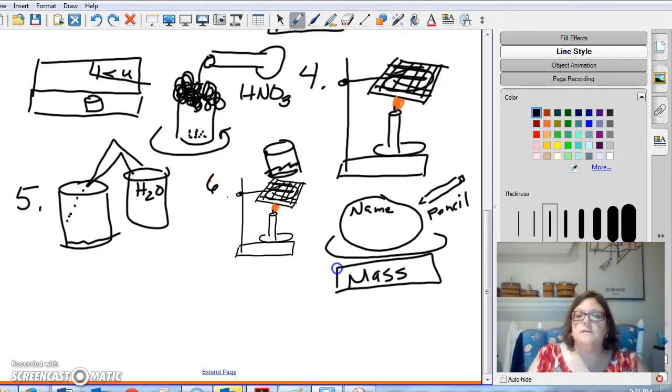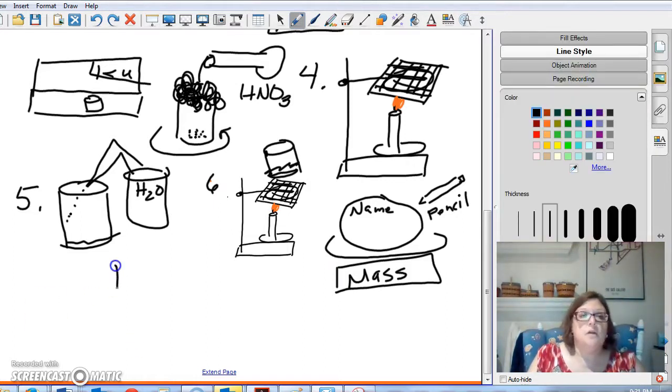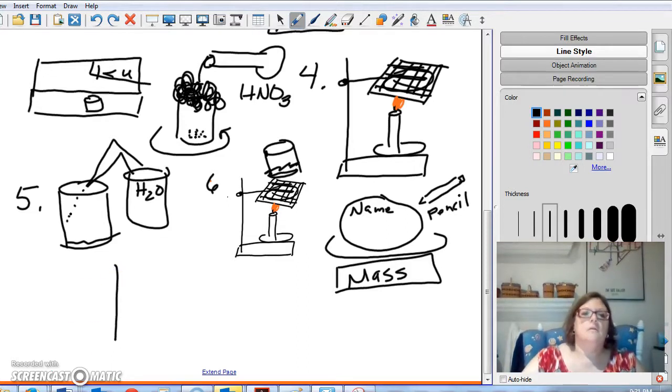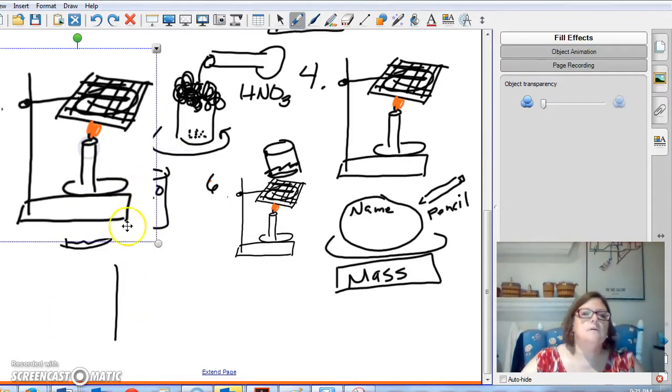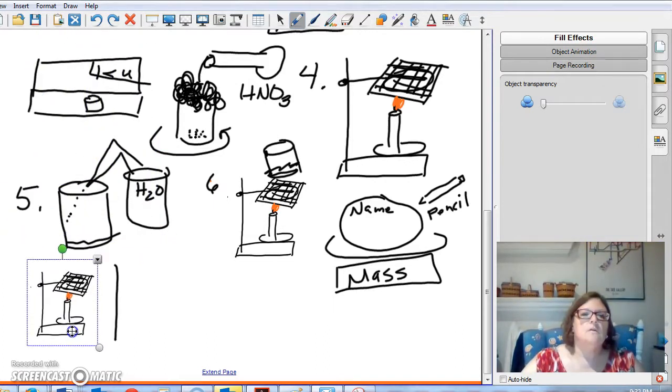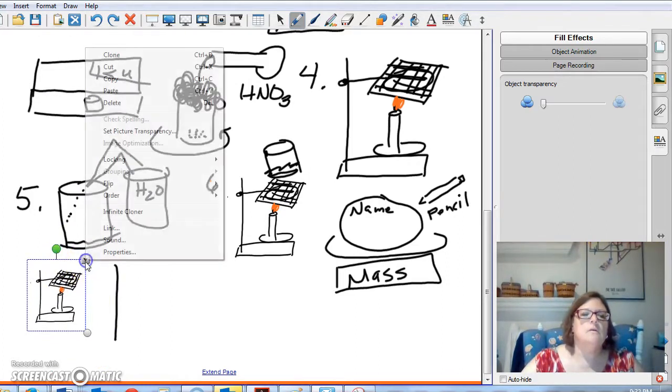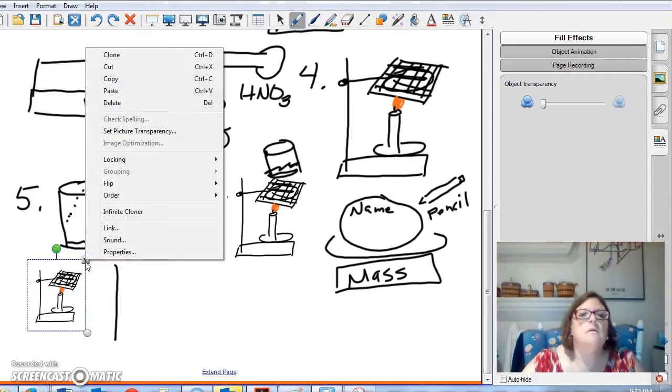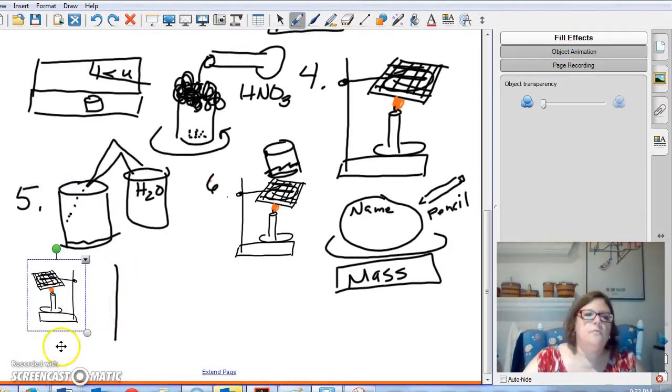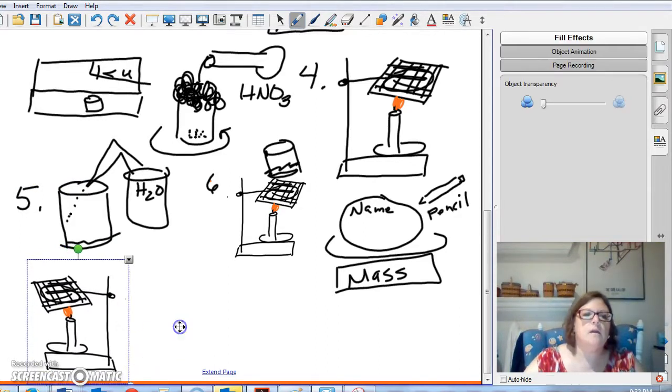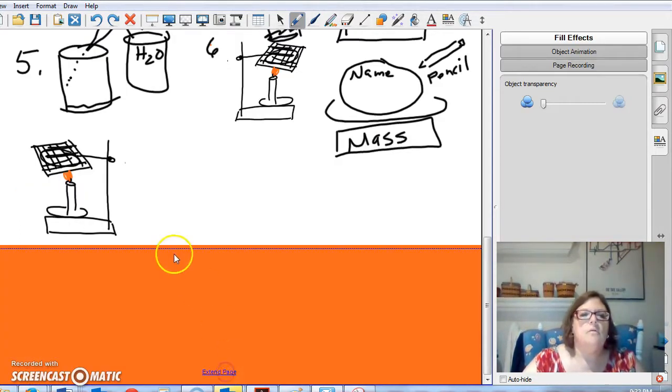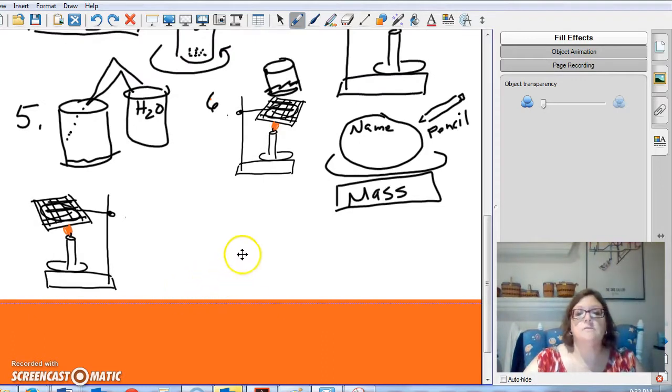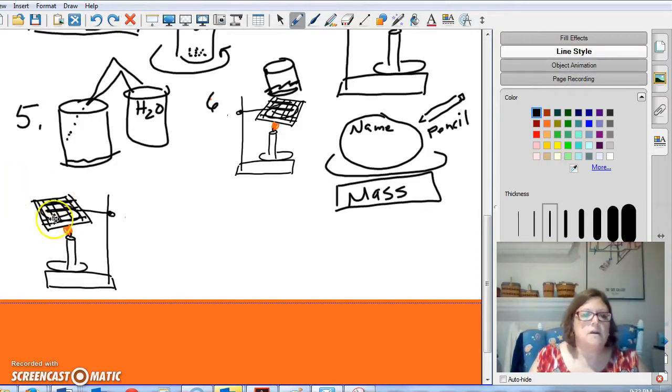Now, the next step is to assemble a filtering system. So, you've got your lovely, let's do this. You've got your lovely, oh, let's flip it. Can we do that? We're going to add our filtering apparatus onto the back of - I don't know why that's orange. That's the color I was trying to get earlier. It's fun with Mrs. Bush. Always exciting. This is step seven.